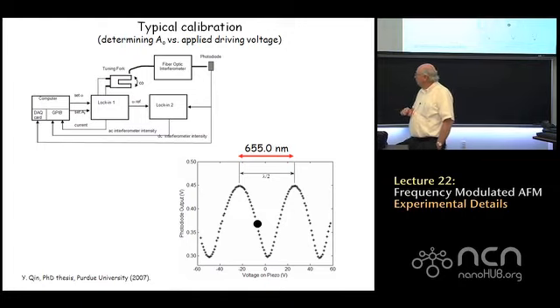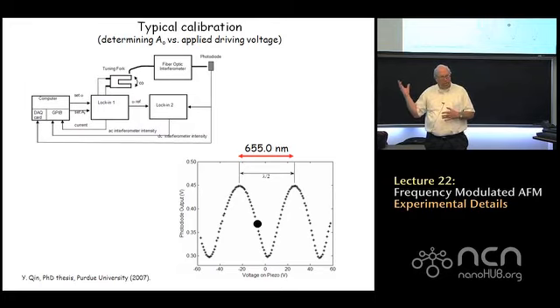And what we've learned is that once you calibrate a tuning fork, its calibration remains very, very reproducible. You can buy dozens of tuning forks from the same company. You can check the calibration of dozens of tuning forks, one with respect to another, and not surprisingly, the calibration constants are all the same.